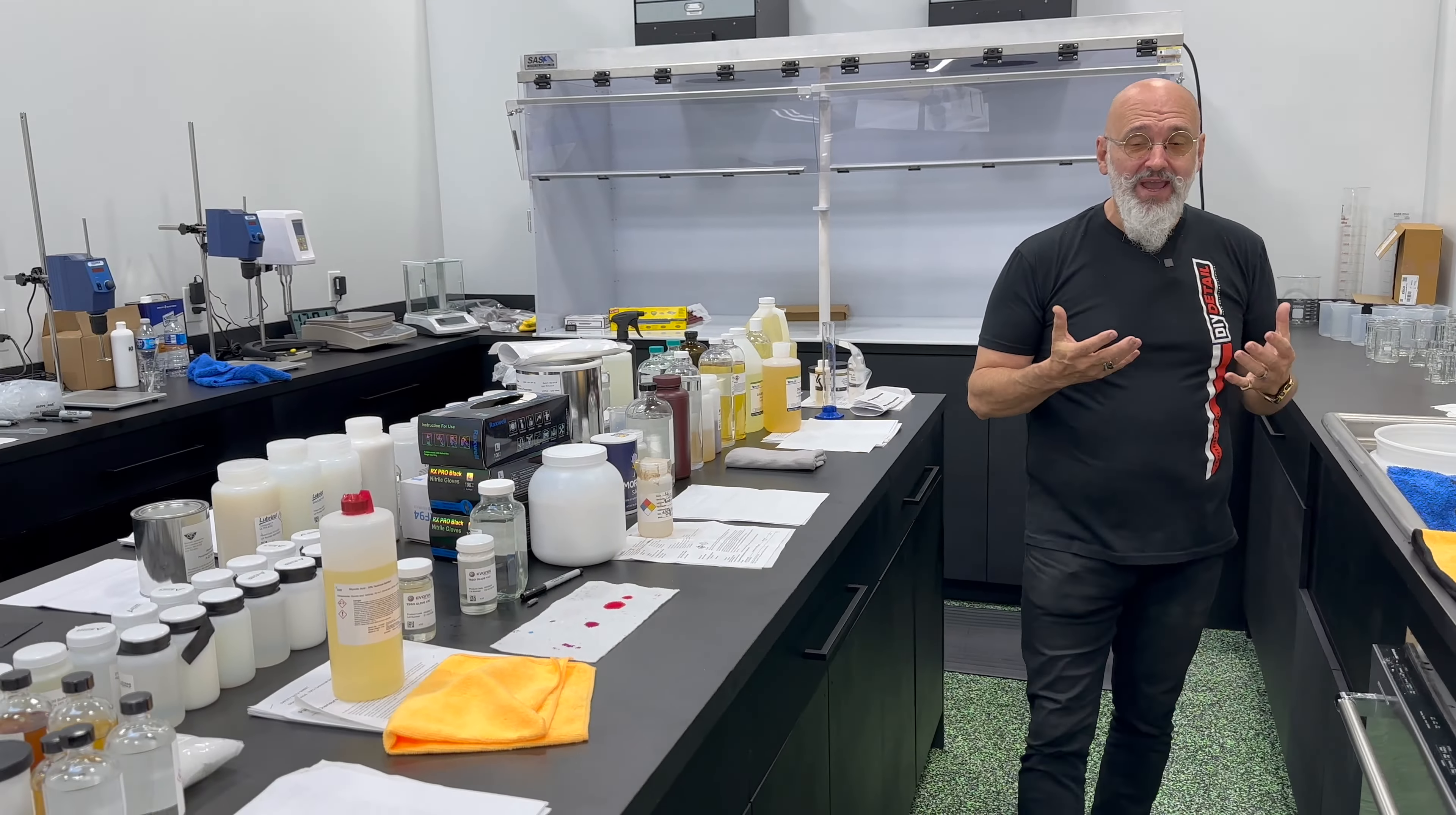This one is an accelerated testing for product separation. There's two of these in the lab. One at 45 degrees Celsius and the other one at 52 degrees Celsius to see what's happening with separation. So very important that the product stays stable on the shelf.